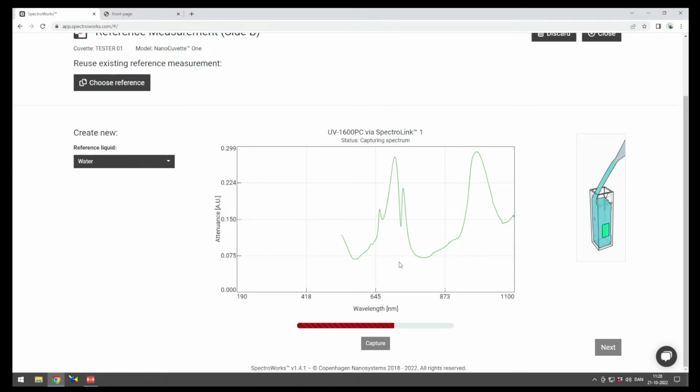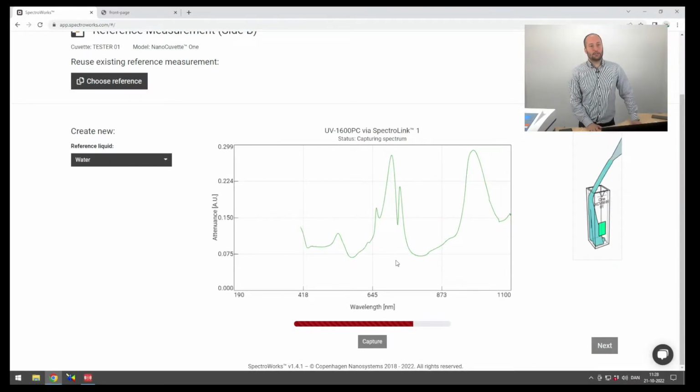And then what are the parameters like? After this step, it gives you how good the crystal is. The last measurement was 80-some odd percent. If it gets to, let's say, 40%, is that when it would tell you it's not good enough, or what is the parameter on that? Yeah, I think 75% is our threshold. If you fall below 75%, then it says don't use it.